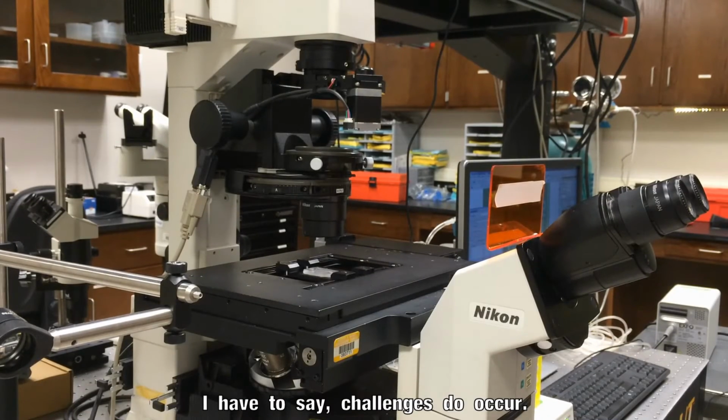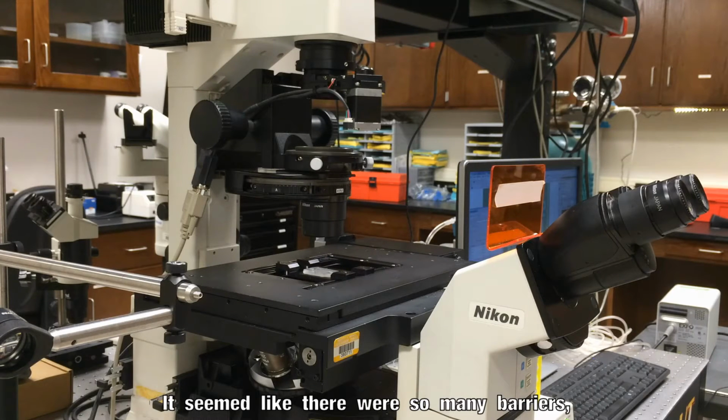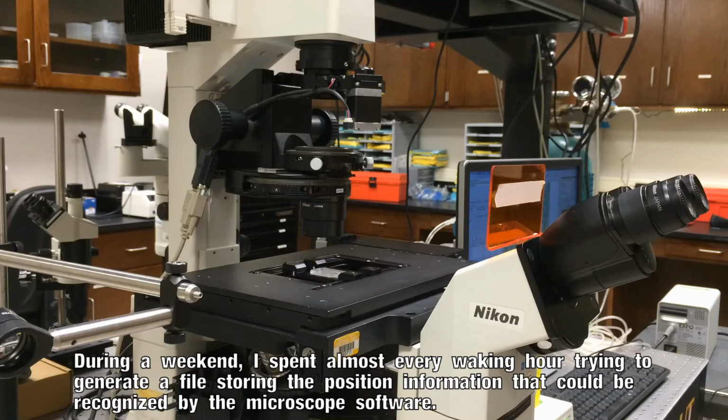I have to say challenges do occur, especially when I got started with my first program. It seemed like there were so many barriers, and even if you managed to pass one, another one would pop out immediately. During a weekend, I spent almost every waking hour trying to generate a file storing the position information that could be recognized by the microscope software.